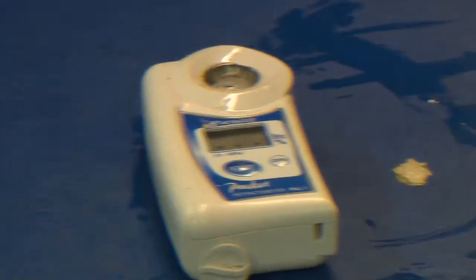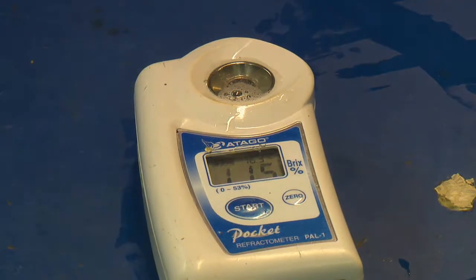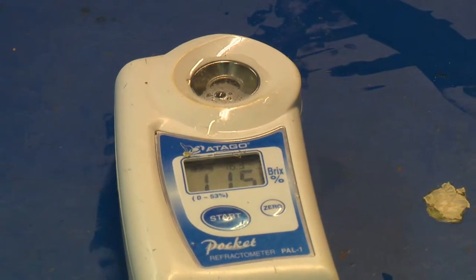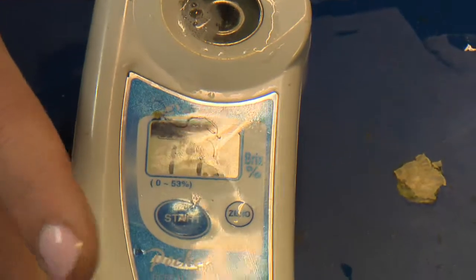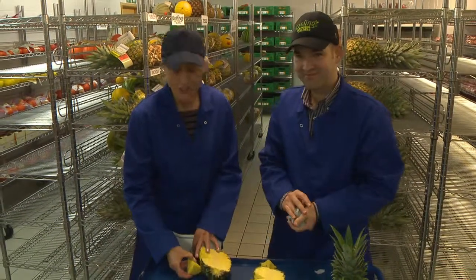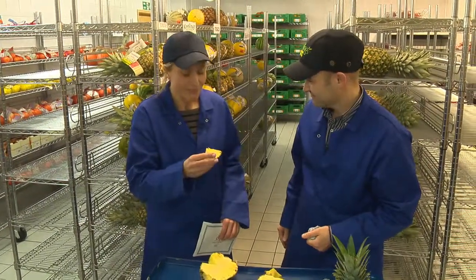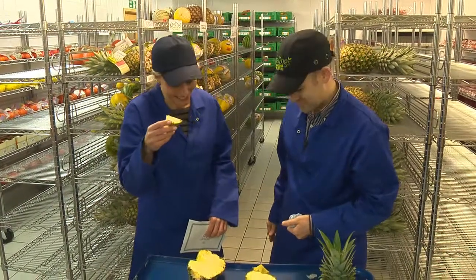Press this button and it should give us a reading. So what are we looking for here, Nick? We're looking for a certain level of sugar reading. There it says 11.5. I've seen higher readings, but that's just about okay. Maybe if you'd like to just taste it — see what you think 11.5 tastes like. That is very sweet and juicy. That is so nice, very, very nice indeed. That's lovely.